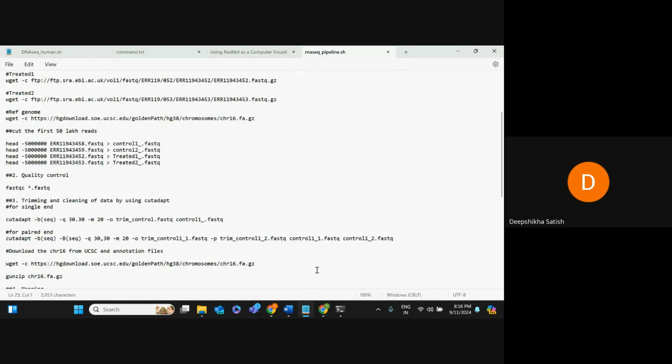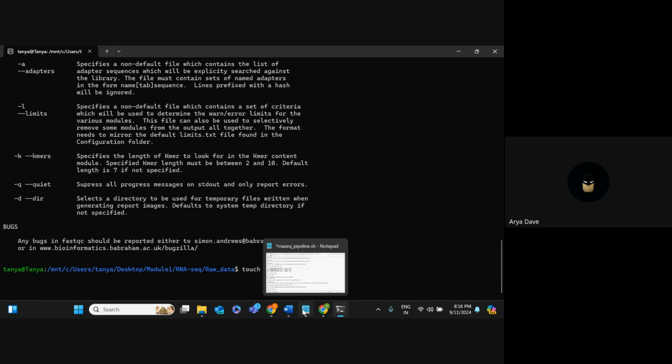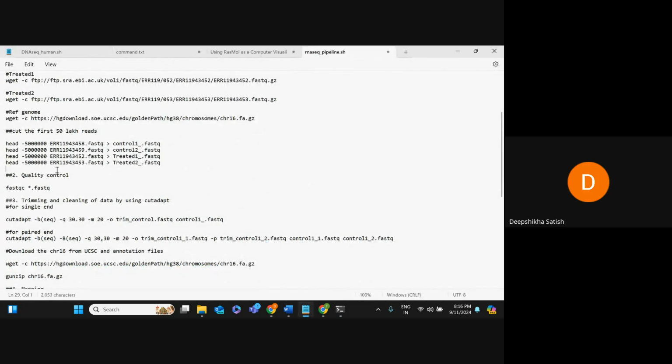Just try this command, touch, because we want to create this script. And every command you have to write in this script, okay, in this pipeline. Is it opened in your system? Yes, ma'am. Done. It's open. Okay, so very first step you have to write here this hashtag.